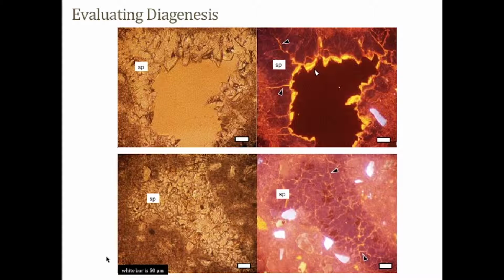So in categorizing these samples by diagenetic alteration, we also came across a sample that gave us some insight into the source of diagenesis, or what type of interaction these samples may have had. Here is a sample from a Raptor section, and it's one sample taken in 2 different sites. And in the top picture here is a microspar lining of void space in the center here, indicated by the dark red.